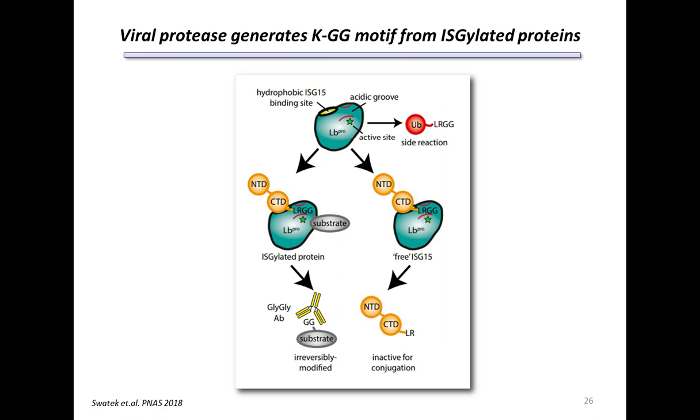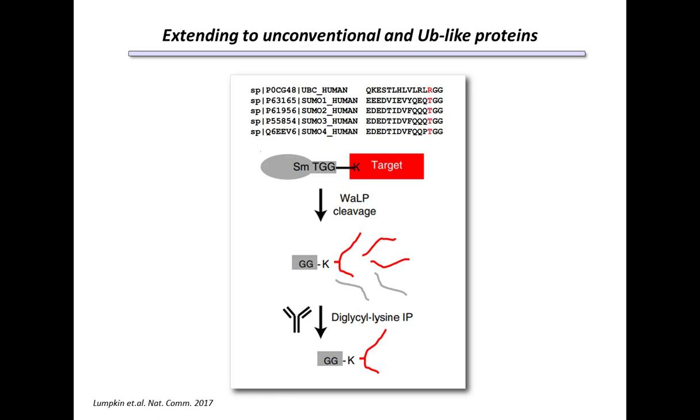In fact, it leaves the same diglycine remnant that we're fishing out at the peptide level attached to protein substrates that it acts upon. And so with this in mind, the same KGG antibodies that we've been using for our experiments thus far now have a whole host of new uses, potentially in studying protein ISGylation in combination with this interesting new protease. Now, the idea of leveraging additional proteases and other strategies to study the ubiquitin-like proteins is, in fact, an area of active work in many groups.